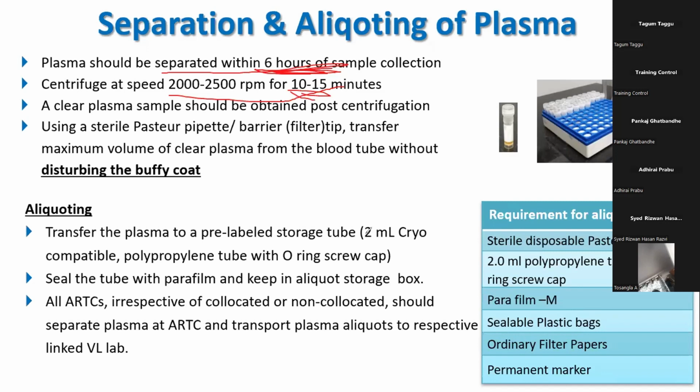Okay, and then transportation will be in 2 ml cryotubes. There is a change in the policy now, irrespective of either co-located or non-co-located. This point has already been emphasized by Mr. Pankaj, that everyone is supposed to separate plasma and send.